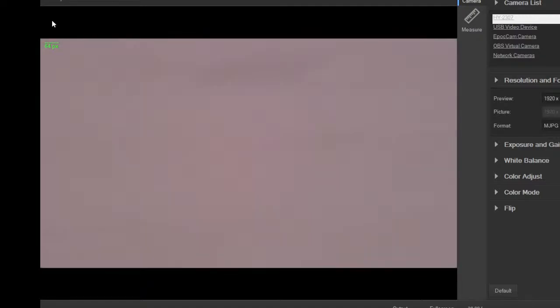Very nice. Let's do little pirouettes. Go, man, go. Unfortunately, it's off camera here. Need to adjust this because I got the slide in the wrong orientation. There we go.